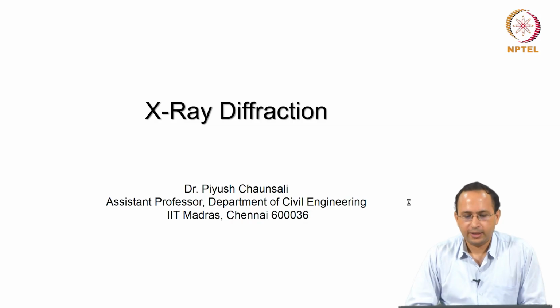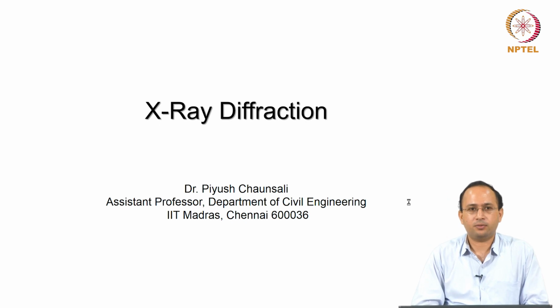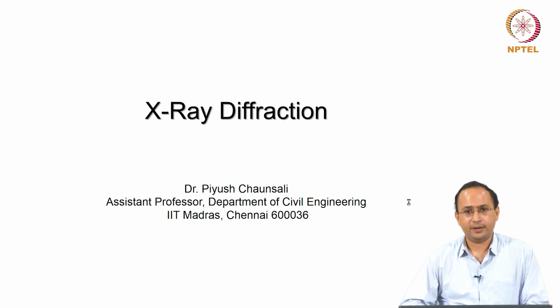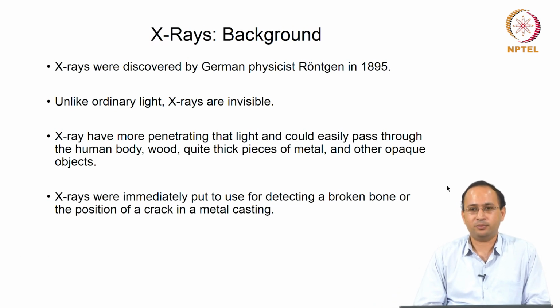Hello everyone. In this module we will learn about X-ray diffraction, which is used quite commonly to understand the construction of materials. So the goal of this lecture will be to know about X-rays, and how we can use these X-rays to understand the material. So we will start with the background. That is very important, to know the history.